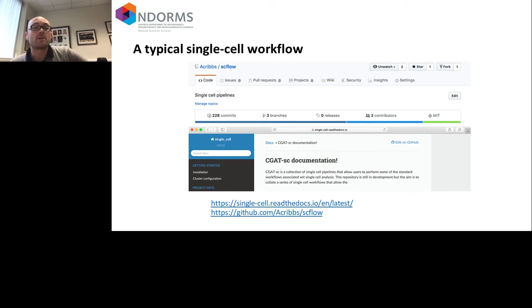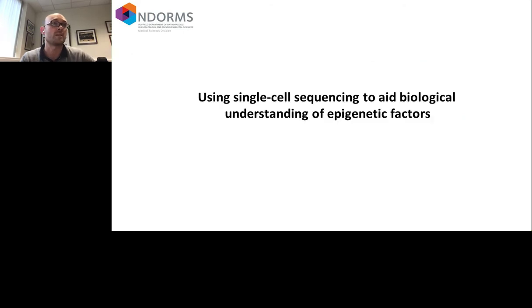So the lab workflows are, if you're interested, all on Git, and the pseudo-alignment runs remarkably fast. Otherwise, I would still recommend Drop-seq pipe if you don't want to use any pseudo-alignment approaches. That's equally, and in fact, it's a really nice Snakemake pipeline.